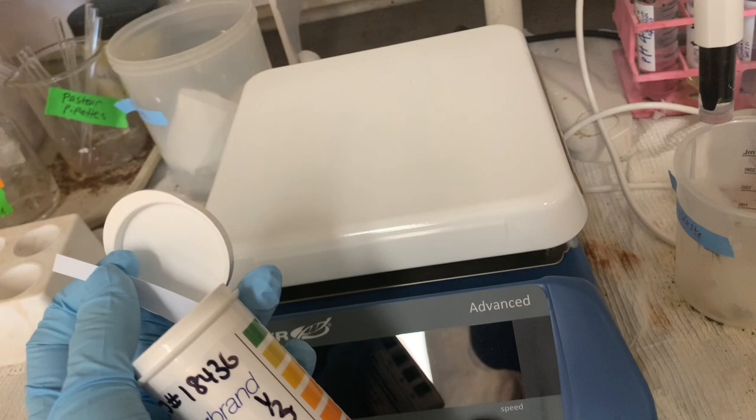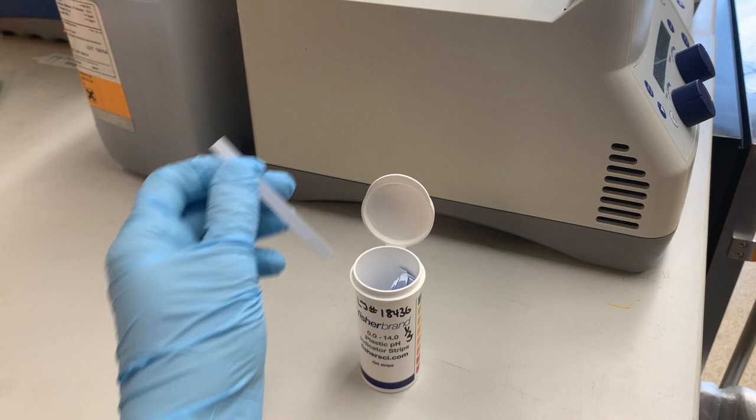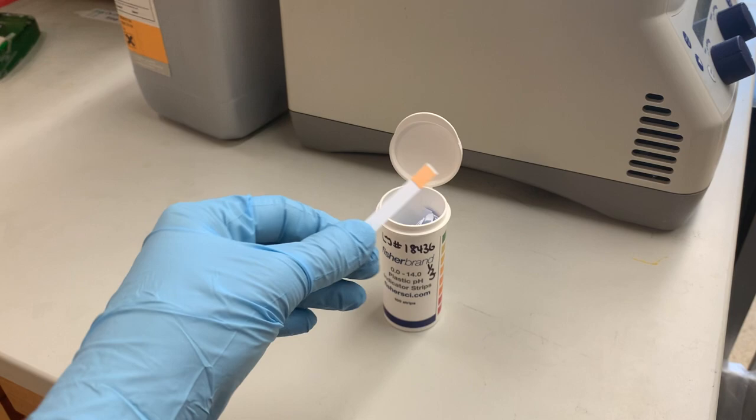To measure pH, we have a couple of options. This is our pH meter — you put the probe tip into your solution and it measures the pH. You calibrate it first using standardization buffers. If you just want a quick look, you can use a pH strip — not quite as sensitive, but good for a quick dip to see if the pH looks about right. If you're having problems with an experiment, it's worth checking whether the pH is way off, because that could cause the experiment to fail. You might have used something similar for a pool.